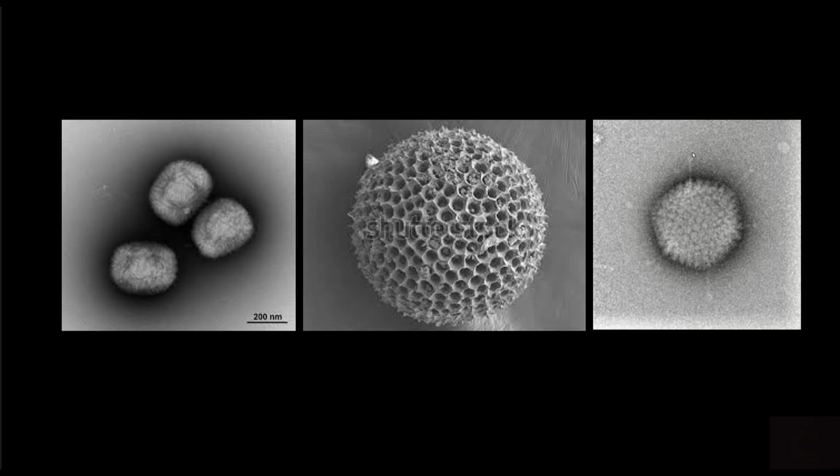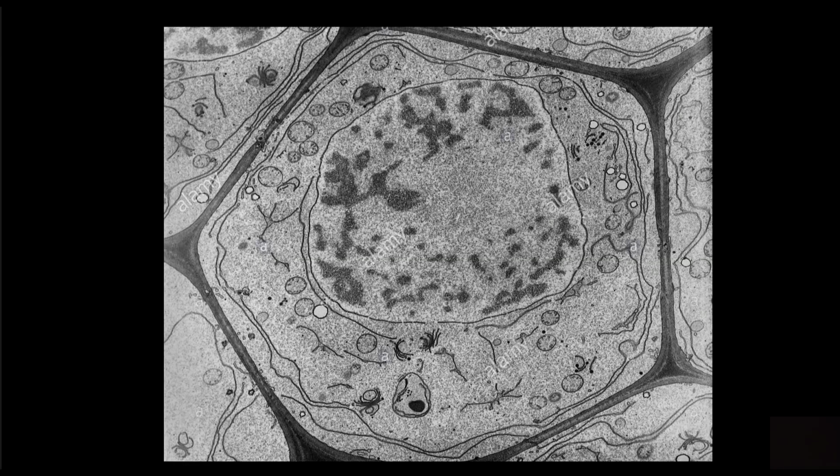And here you go, though. Look what we can see. You can actually see the binding. This is a virus, and you can see the little attachments even under the scope. There are other types looking at structures, and it's quite amazing. This is really an amazing photograph. We were looking inside a plant cell.